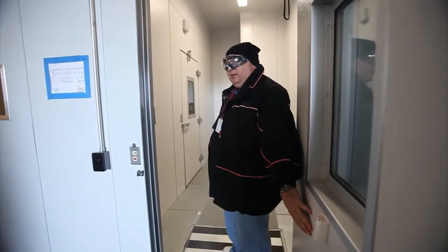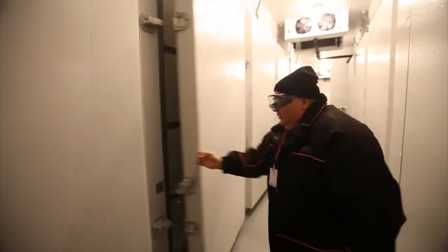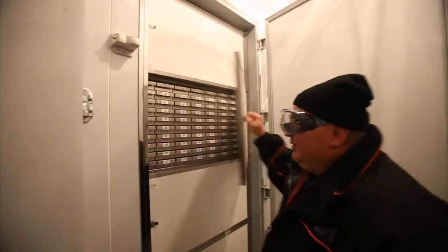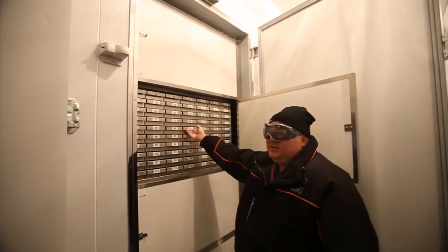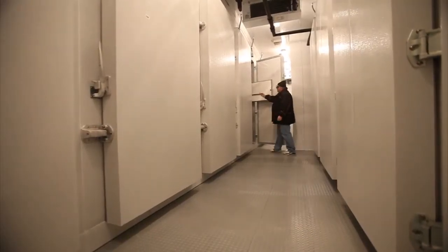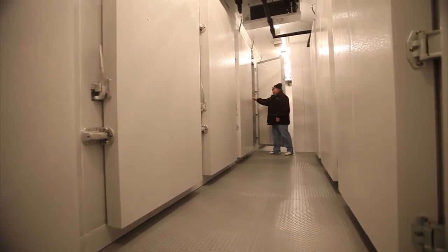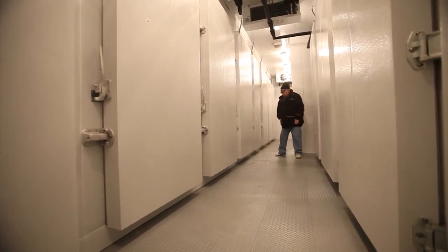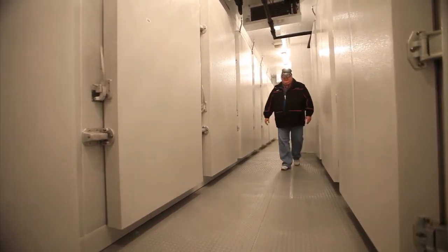Working in the minus 80 degree space is a lot different than working in a normal laboratory freezer. We require at least 2 people to go into the facility at a time, so you have to work on the buddy system. At the temperatures that we're talking, we don't walk into the minus 80 chamber itself. We walk into a minus 20 freezer, which would be like your normal freezer that you'd have in your house. But within that are additional chambers that have 4 times lower temperature than what you're currently in.